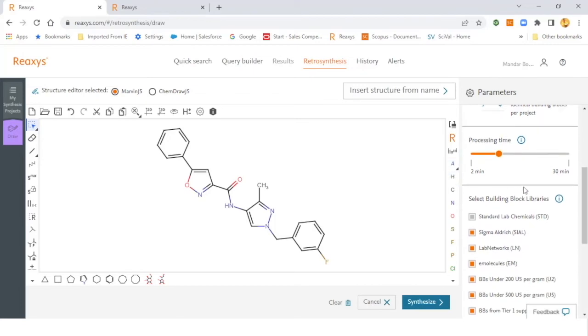One can play around with the processing time ranging from two to 30 minutes. Max is 30 minutes. What we have observed is that within five to seven minutes, we will be able to obtain the synthetic routes for medium complexity molecules.